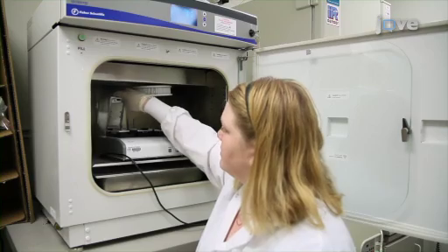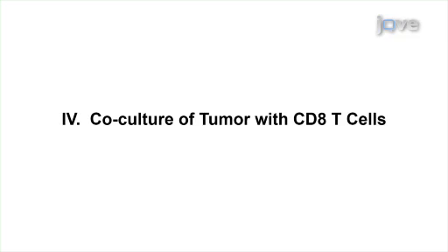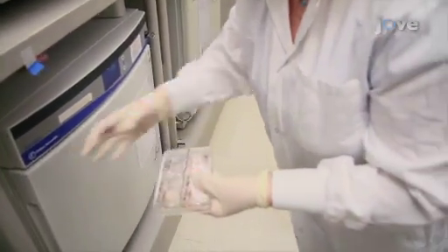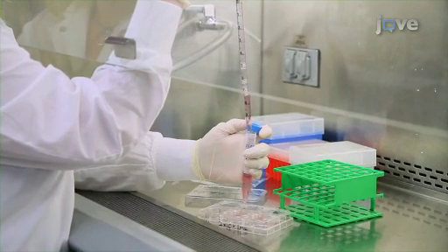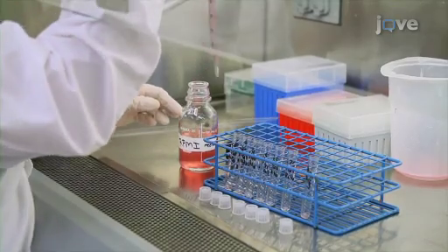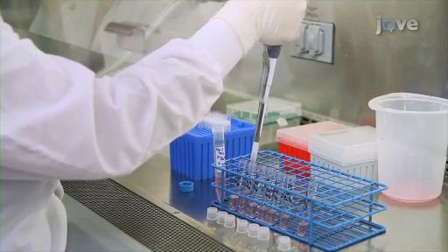After the tumor cells are added, load the plates in the Excelligence station and start taking readings. The tumor cells will immediately start adhering to the E-plates. After about 18 hours of incubation, the tumor cells will have attached to the E-plates and doubled to 15,000 tumor cells per well. At this time, harvest prepared T-cells by gentle scraping and agitation. Centrifuge the T-cells, reconstitute them in RPMI media with 10% FBS, and count them using a hemocytometer. Once the cell density is known, prepare a two-fold dilution series of T-cells such that when 200 microliters of T-cells are added to the tumor cells, the highest concentration is 40 T-cells per tumor cell.